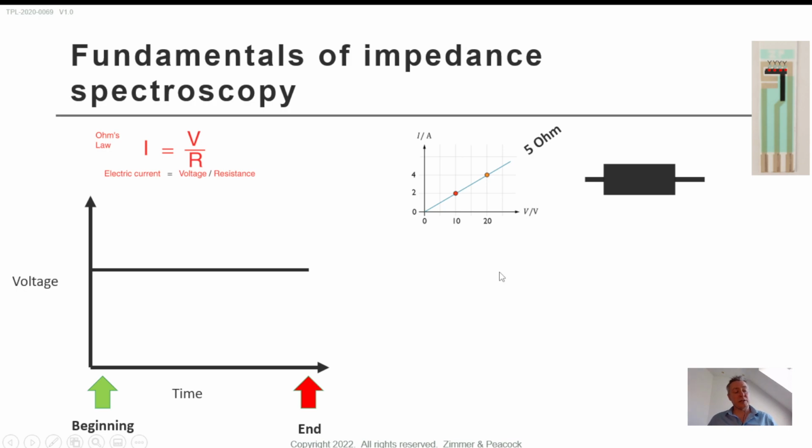I'm going to specifically talk about Faradaic impedance spectroscopy. I'm not going to be talking about non-Faradaic impedance spectroscopy. I prefer Faradaic impedance spectroscopy. You might have to look up the definition, but in Faradaic impedance spectroscopy, I've put a molecule in there that I know is electrochemically active, and I want to watch how that molecule's interaction with the surface changes as I get binding.